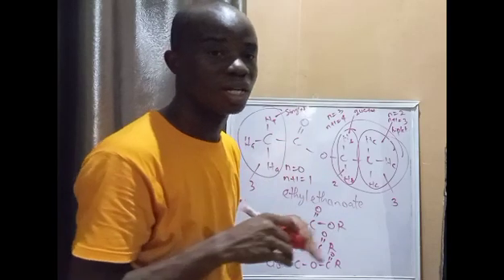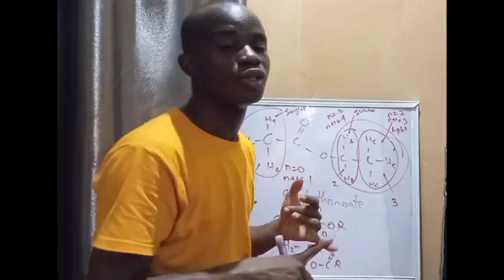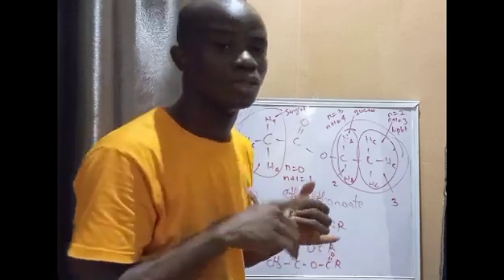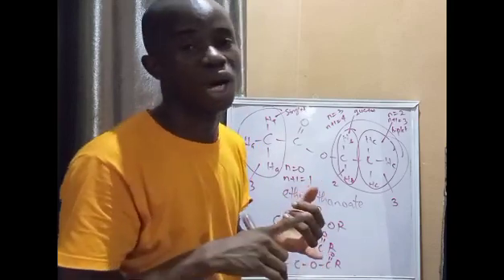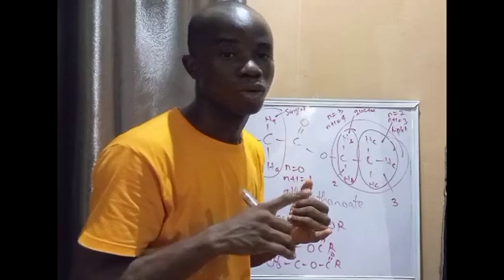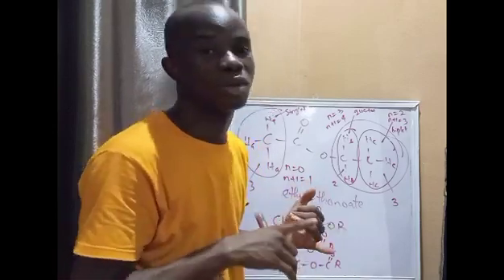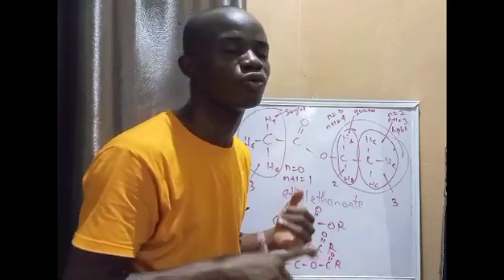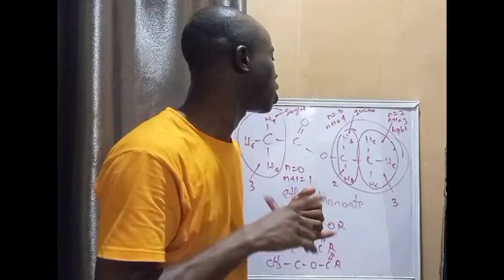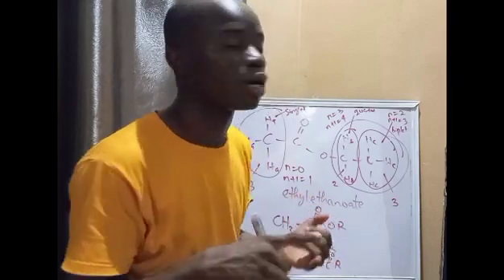So like I said earlier, the 4 major points which I've mentioned, which is one, the number of signals in an NMR spectrum, which indicates the different kinds of hydrogens that you have in the compound represented by the NMR spectrum. The second thing is the chemical shift, which indicates the chemical environment of these different protons producing signals in the NMR spectrum.